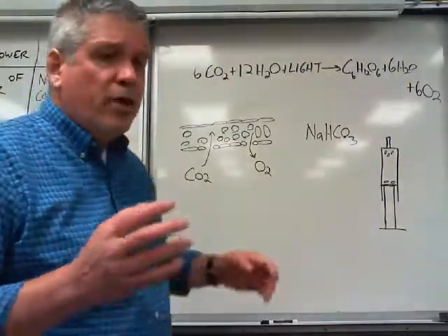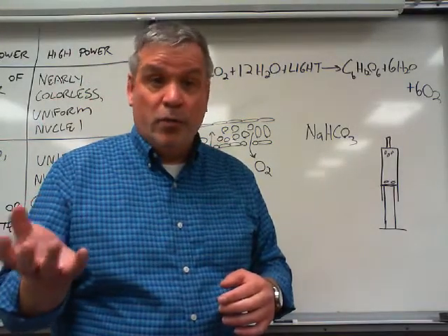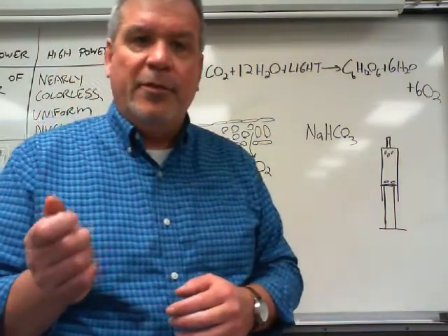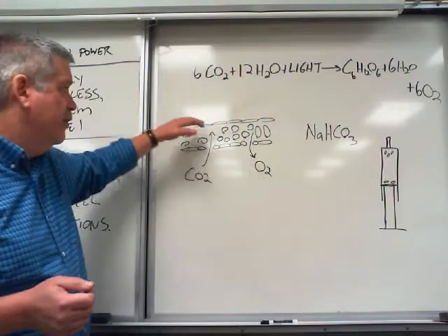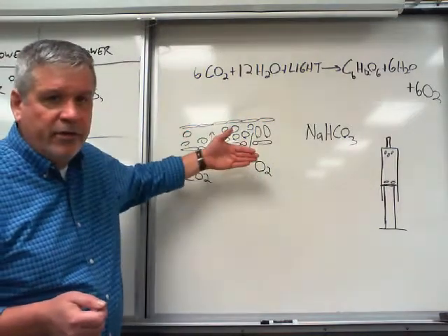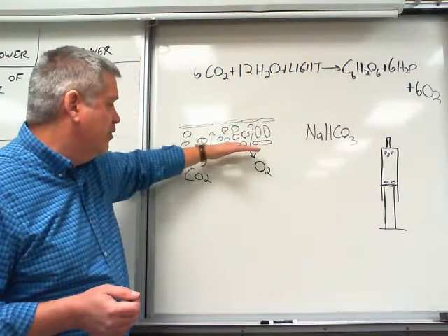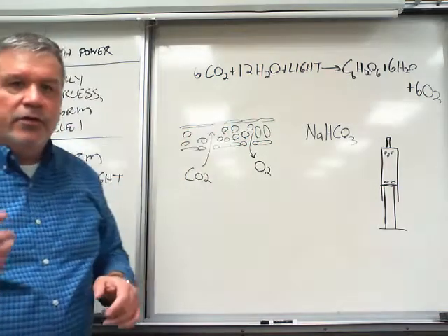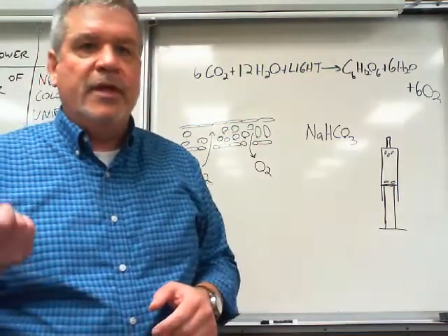So normally leaves will float on water. You've probably all seen this. The reason for that is there's air trapped inside of a leaf. If we look at the structure of a leaf, imagine this is a cross-section of a leaf. So we have one layer of cells on the outside, another layer of cells on the lower side. In the middle of the leaf, there's a loose arrangement of cells called mesophyll.